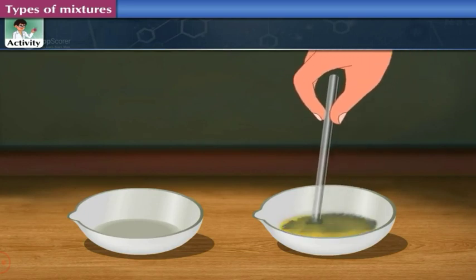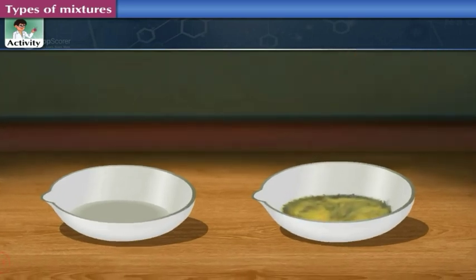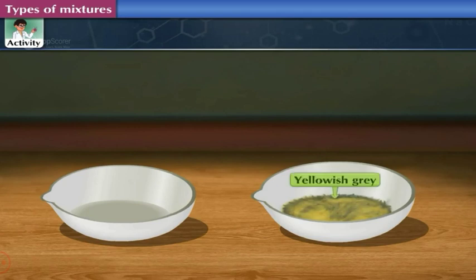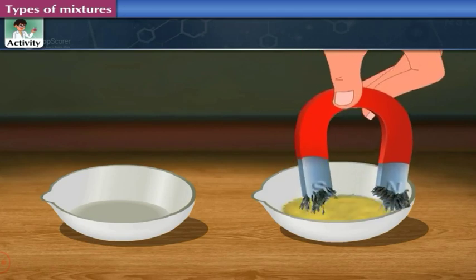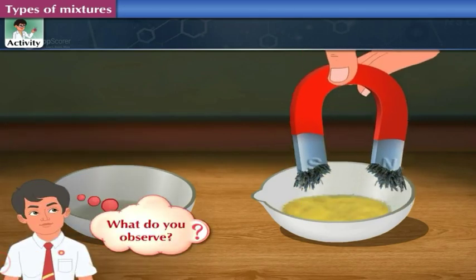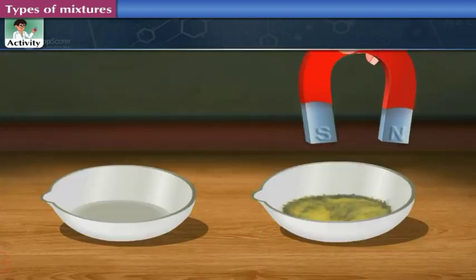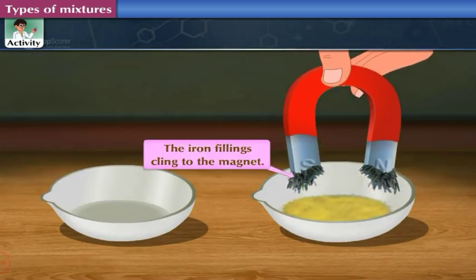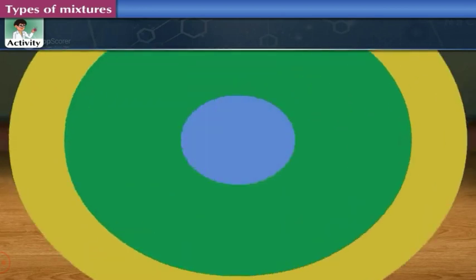Observe the color of the contents in the dish. It is yellowish-gray in color. Once again, bring the magnet near the contents of the dish. What do you observe? The iron filings cling to the magnet.